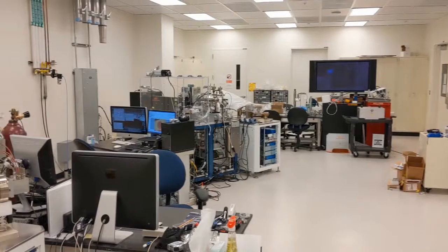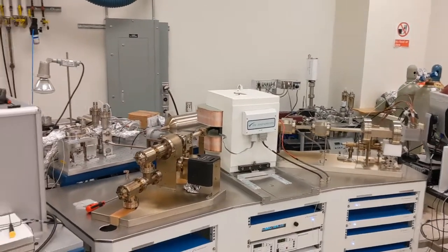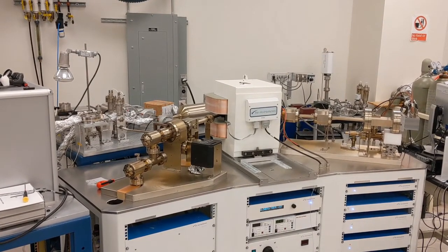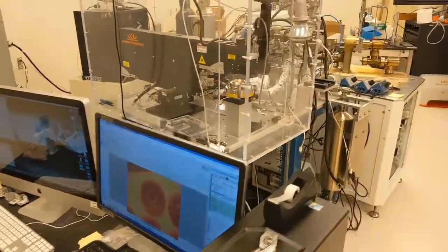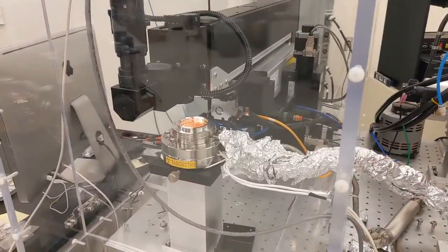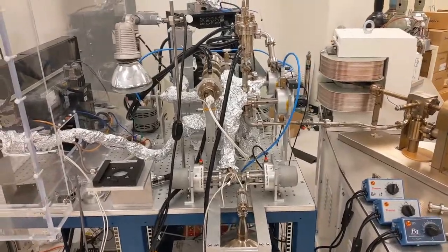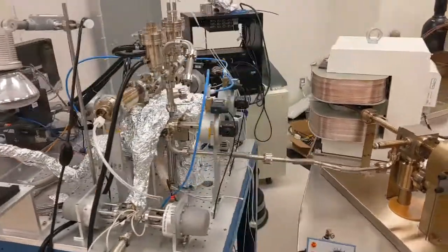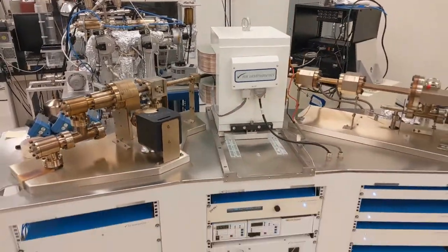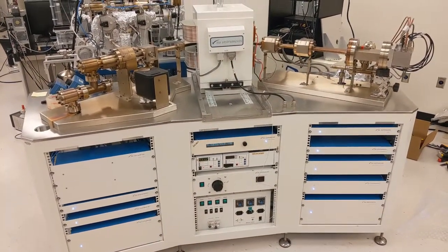The lab is located in the basement of ISTB4 and contains 5 mass spectrometers that allow us to determine the age of rocks through the measurement of parent radionuclides such as uranium and their resulting daughter decay products such as helium-4. We can also measure noble gas concentration gradients across a mineral domain. These gradients are imparted by thermally activated diffusion, most often the result of a geothermal gradient in the Earth's crust, and can be used to quantify the time temperature history of a rock, and therefore allow us to unravel geologically useful information like the history of erosion and tectonic uplift.